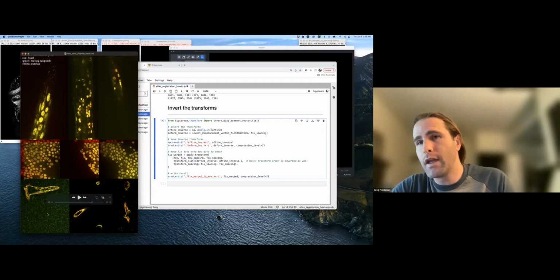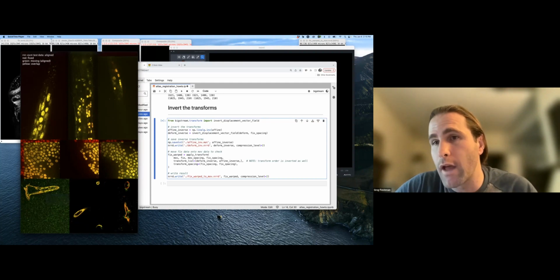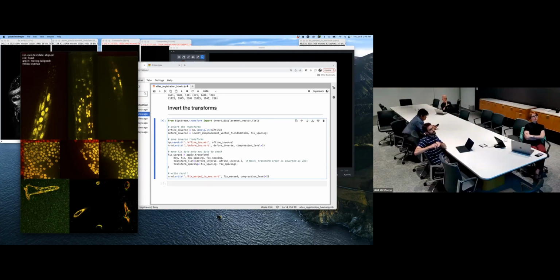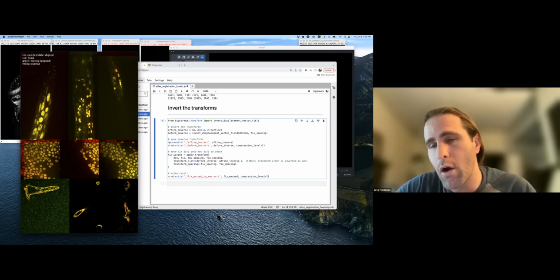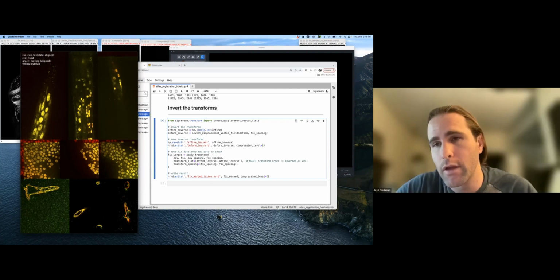So my first answer regarding automated registration tools is that even when you have low quality data, if you strategize how you do the alignment in a way that is really gentle and careful, you can still succeed. And then my second answer is that humans are always better than computers at recognizing what two things should go together. So a manual tool is a really good way to start.